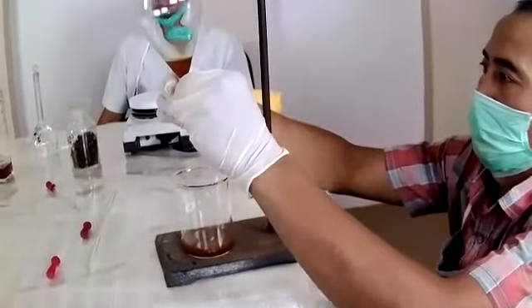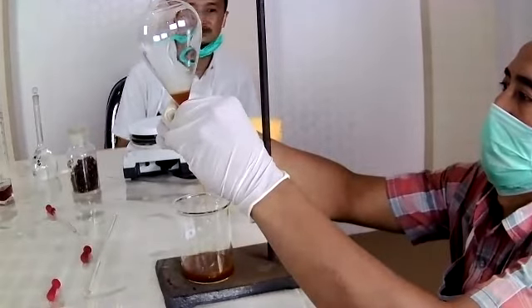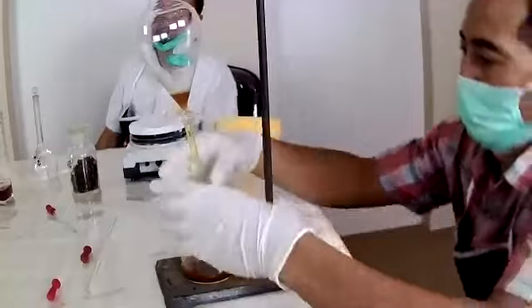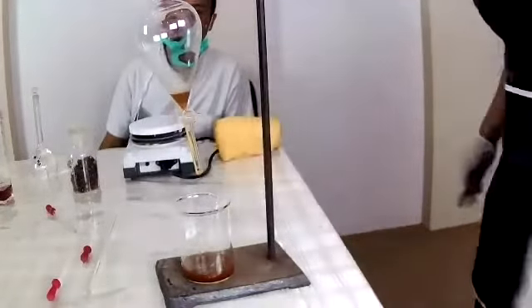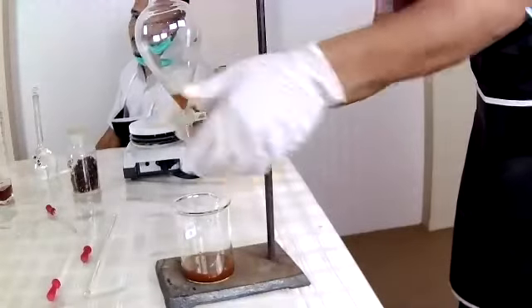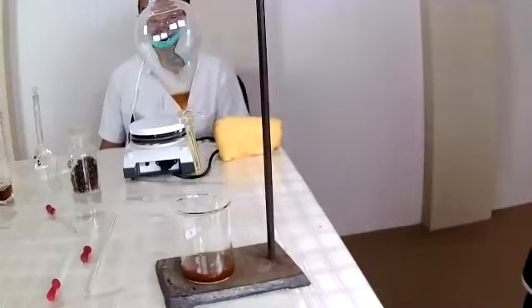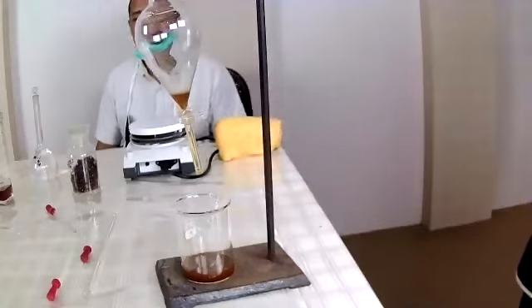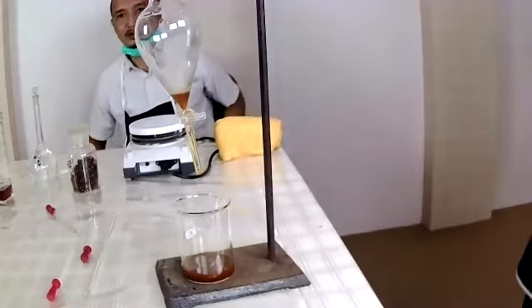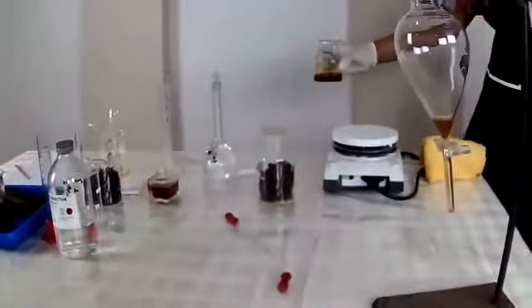We can continue the extraction. The light brown here is the caryophyllene, and we are not using that, as I said before. The caryophyllene does not have the active property for our purpose. And then we will convert this back to eugenol.